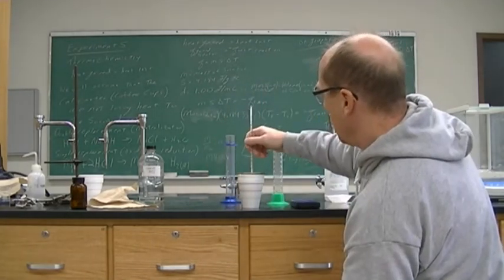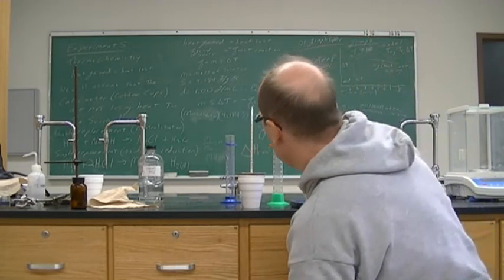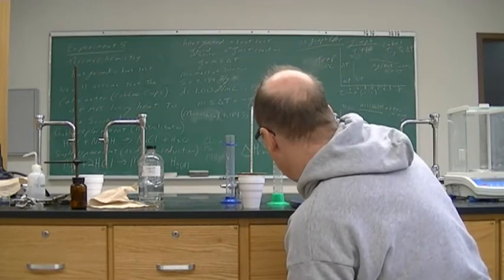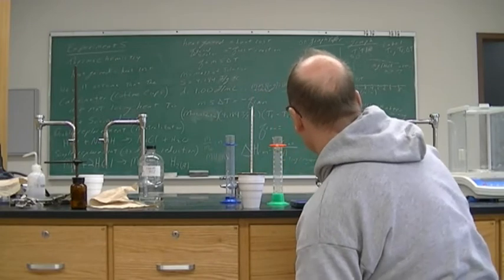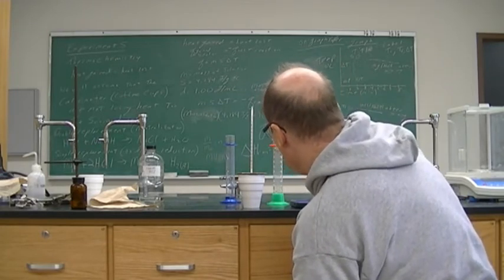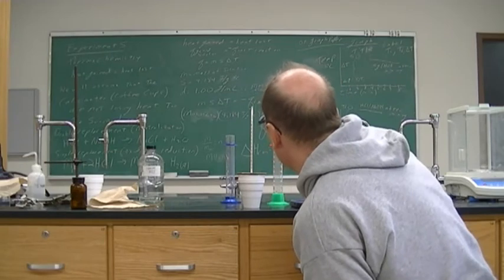And then our last data point. There are a couple of bubbles, but pretty much the reaction has been completed. And our temperature is still not changing.